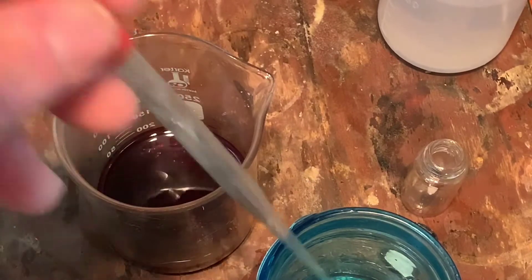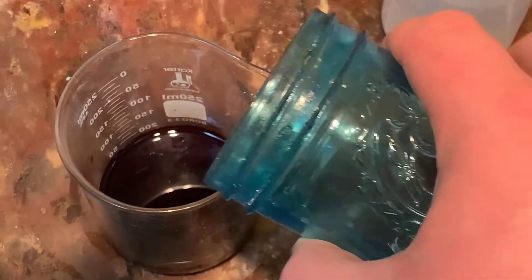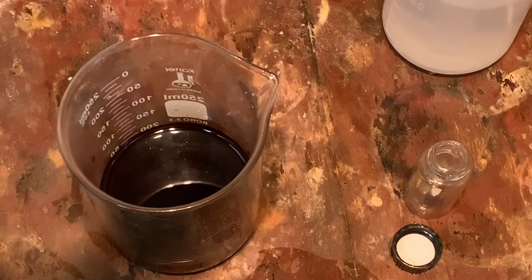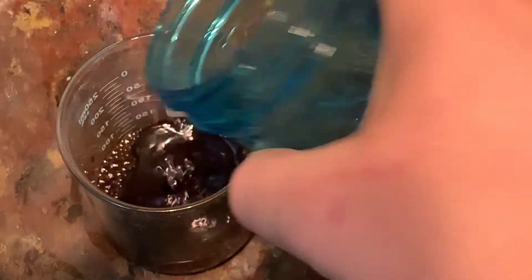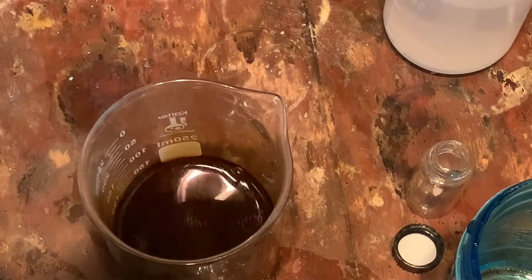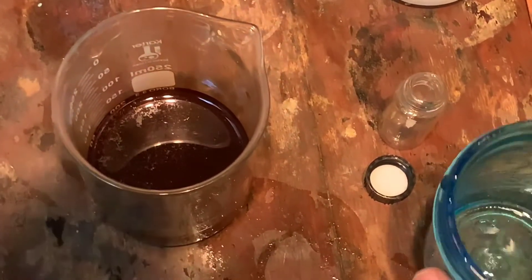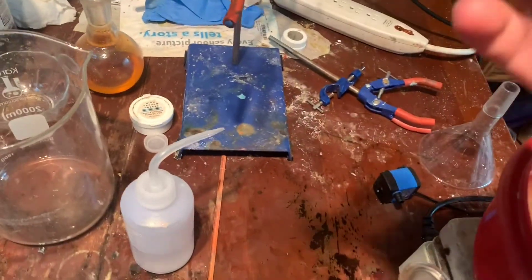This precipitates the iodine. A little bit more hydrogen peroxide. We're going to wait for that to settle, then we will filter off and we will have our iodine. You need to add 20 mL of 3% hydrogen peroxide to get it all to precipitate out.